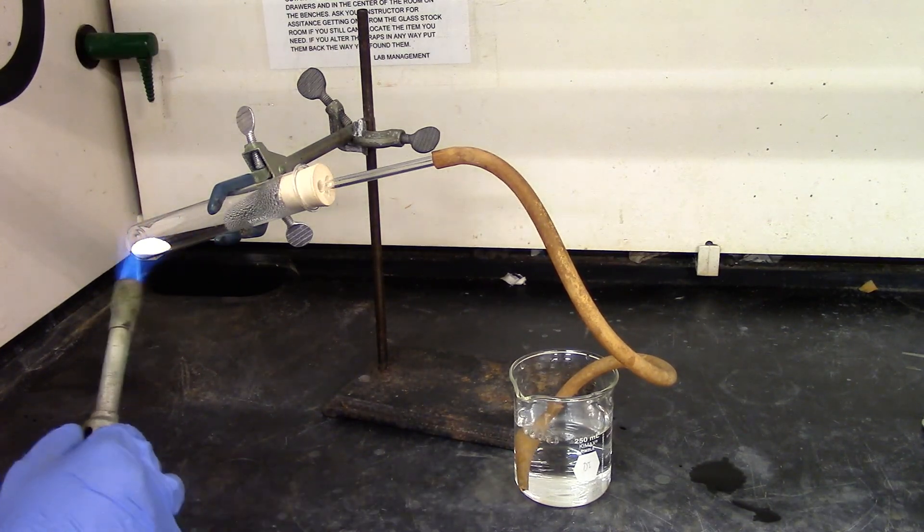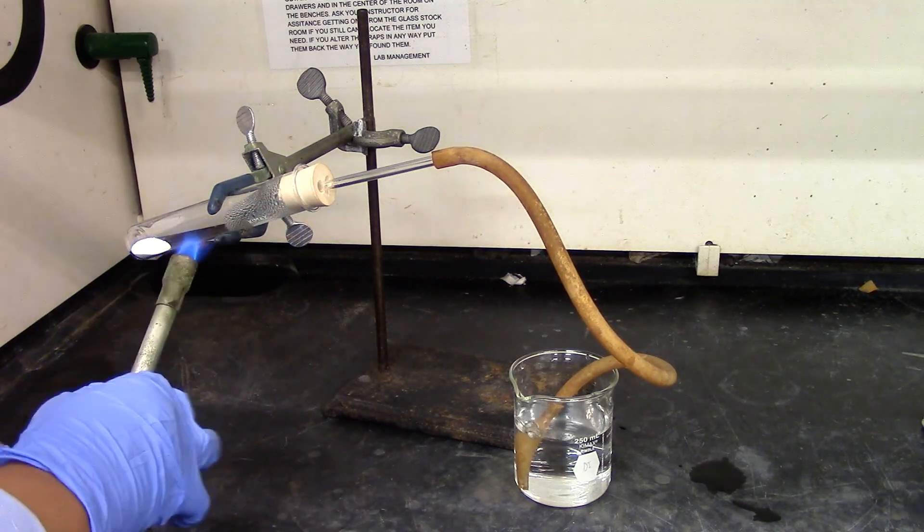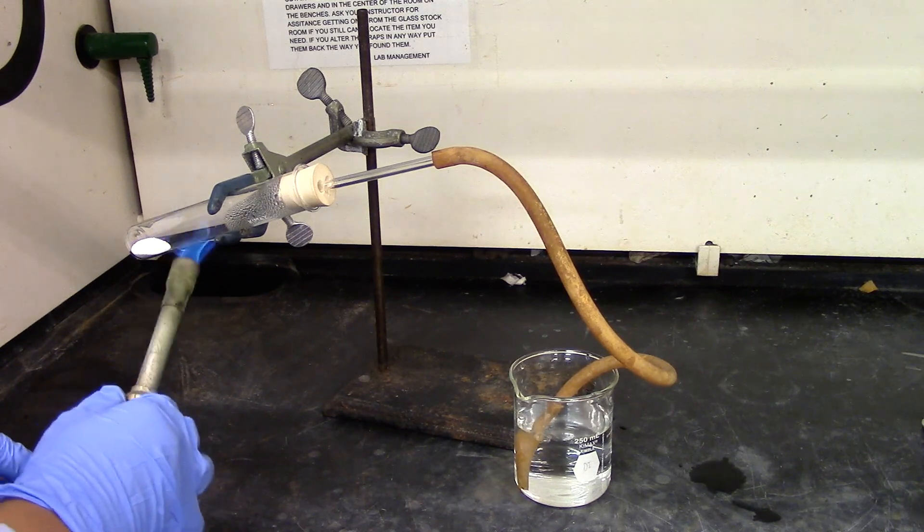We're heating back and forth for even heating. And if you see a drop of moisture coming down, you have to quickly heat the test tube above the solid.